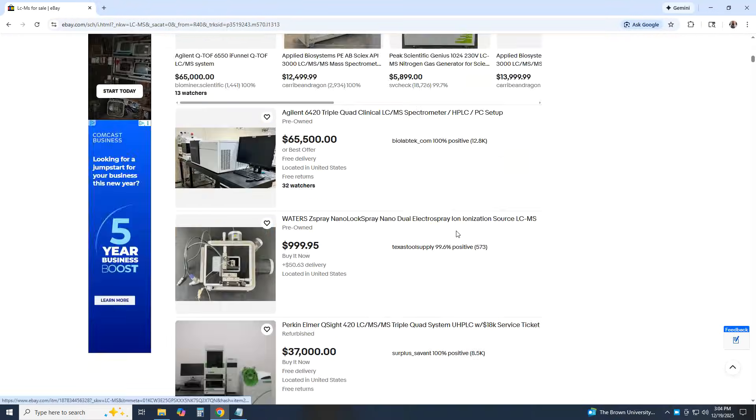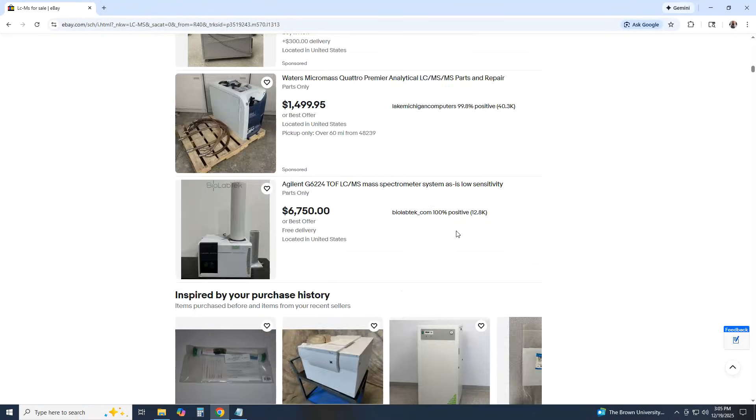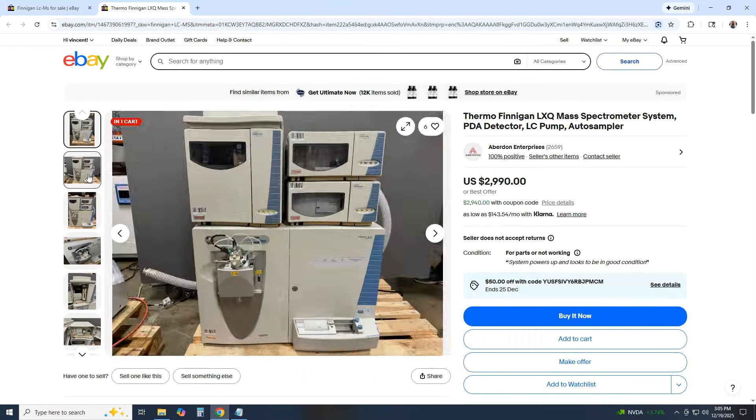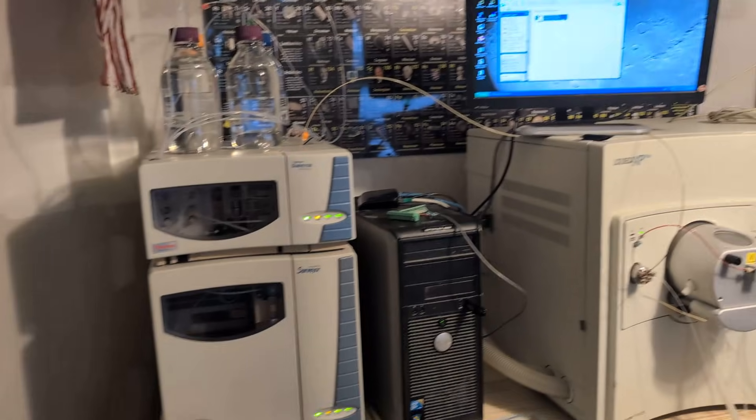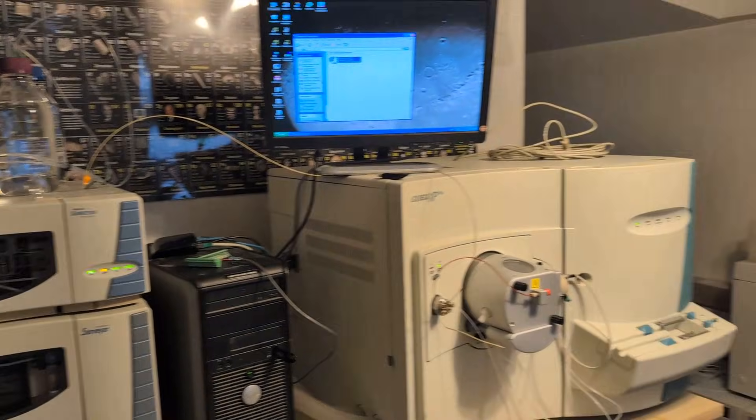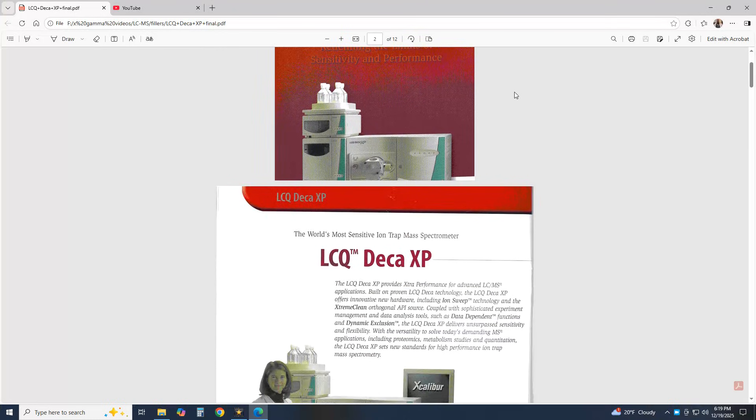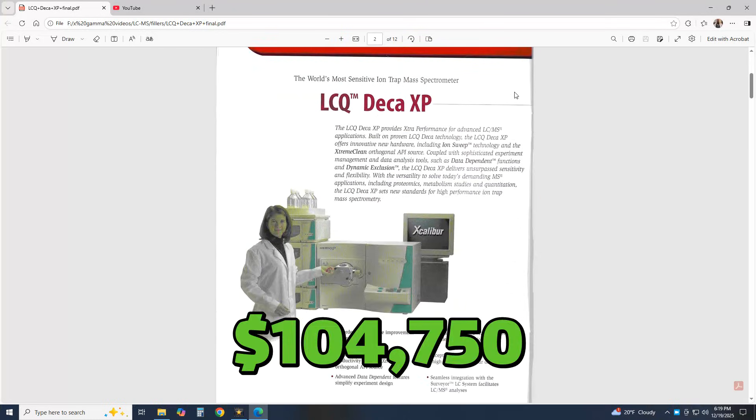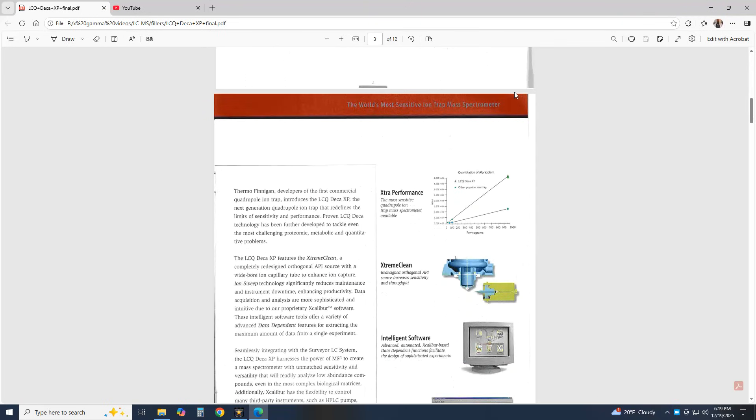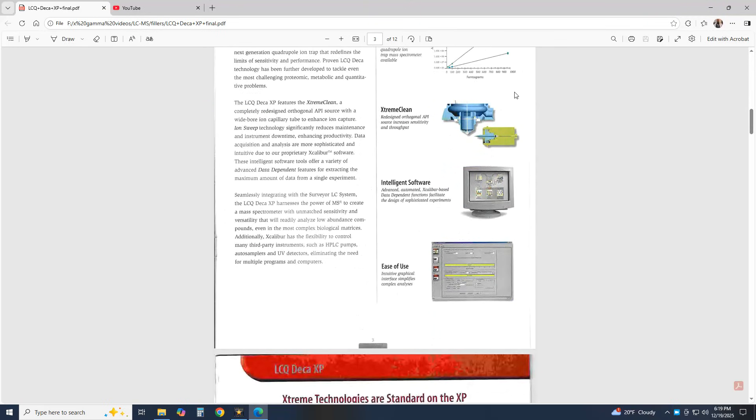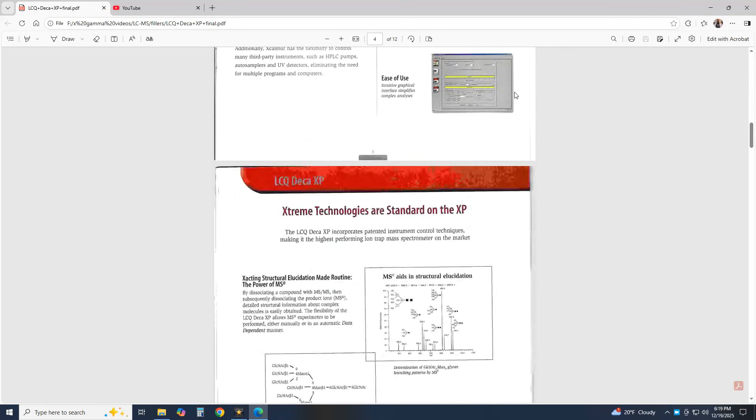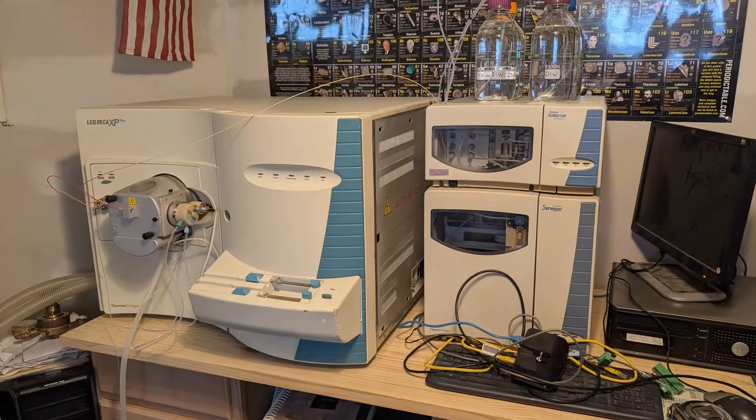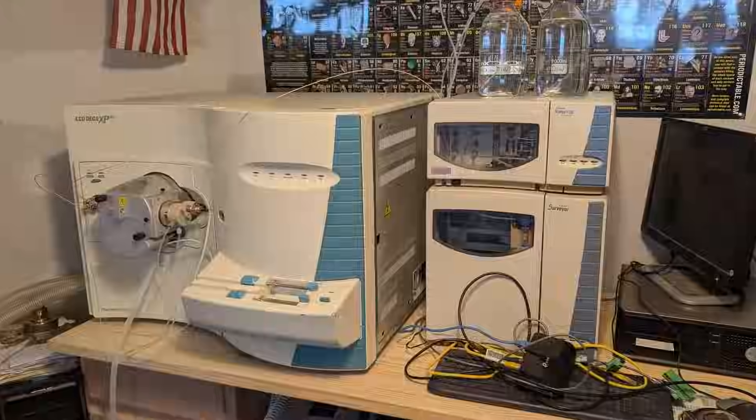In my everlasting quest for analytical instruments, I came across this LC-MS combo on eBay and decided to try my luck with this equipment. It was sold in 2003 for over $100,000, but after 22 years I bought it for pennies on the dollar, saving it from destruction as secondhand equipment.